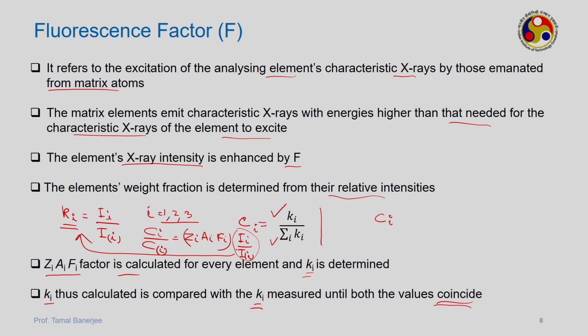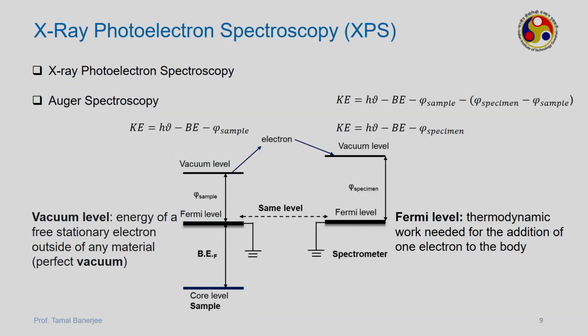So, these things they do directly in the spectrophotometer. So, that is taken care of. So, we complete the X-ray fluorescence spectroscopy.